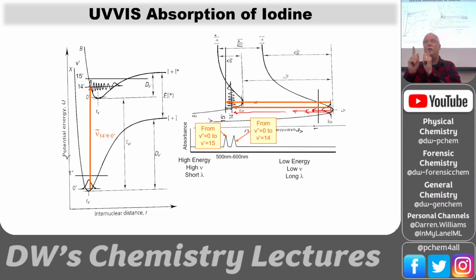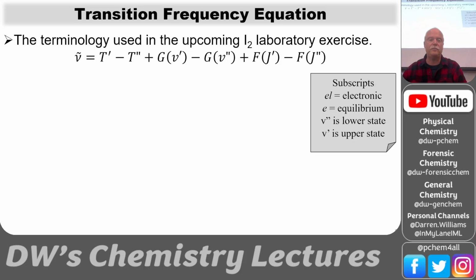And there's a place where all 3 of them overlap. Just a small region, but all 3 are overlapping because the spectrometer doesn't care. It's just scanning wavelengths. And if at this frequency it goes from the hot band of 2 to 15, that's great. And if it's at a different wavelength that goes from 0 to 21, that's great too. And so we end up with this really complicated spectrum.